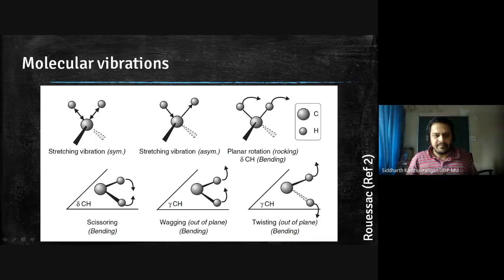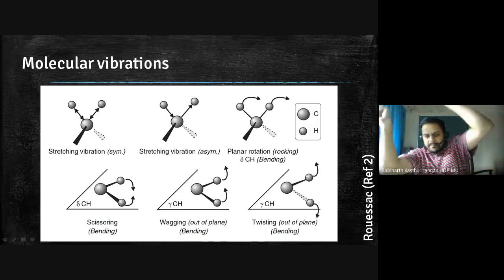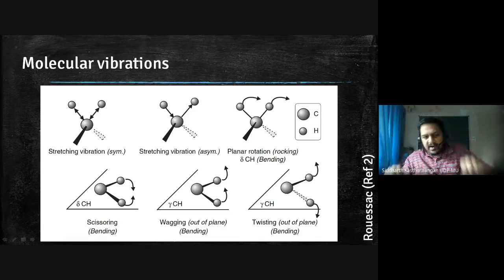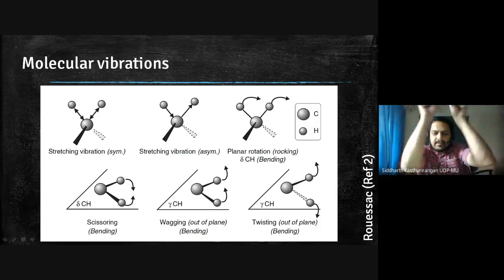in the diagram. Then you can also have, see, my bottom part is stationary, only my top part does this. That is called rocking vibration naturally, because it is like a rocking. Okay. Then there is something called scissoring vibration. What is scissoring vibration?